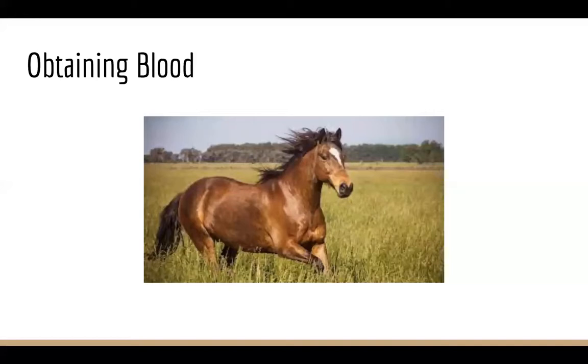And then once you've got the blood, you can defibrinate. Blood has fibrin in it, and that causes it to clot. To defibrinate blood, you mix it inside a glass vial with either beads or some kind of agitating agent for less than 60 minutes, to ensure that you don't lyse the cells and cause hemolysis. What you'll get is a big clot of blood on your beads or on the mixer you're using, and you take the clot out, and what you're left with is the defibrinated blood that you can use for samples and for agar plates.